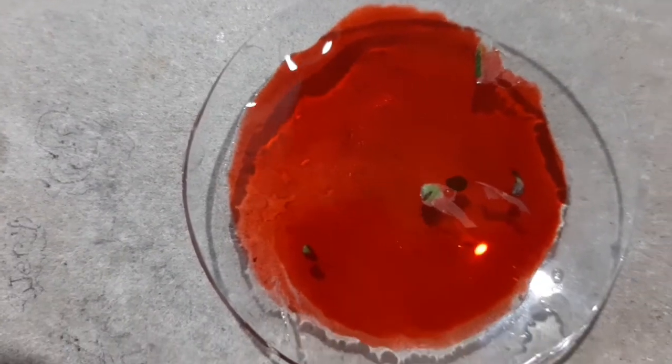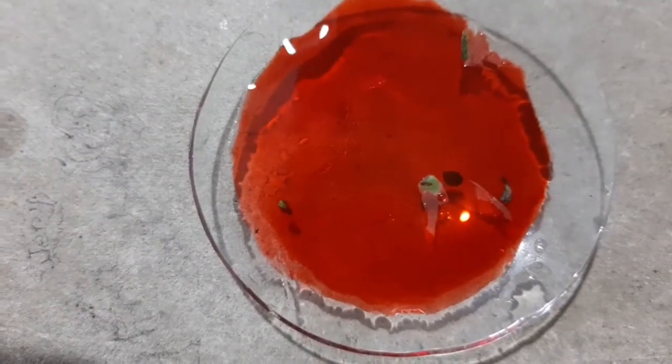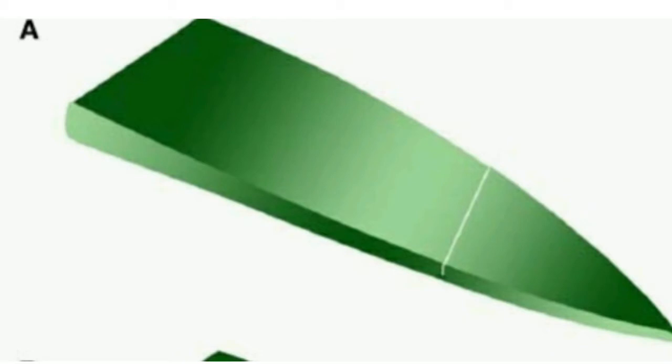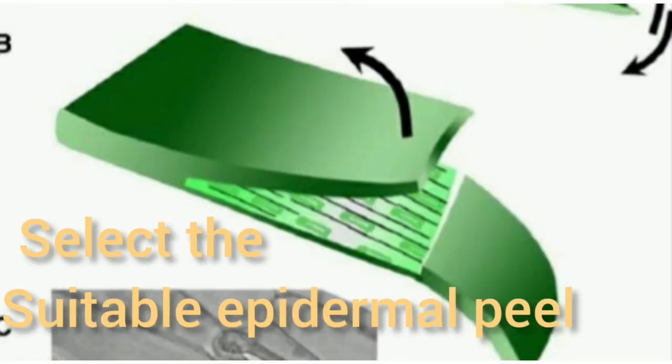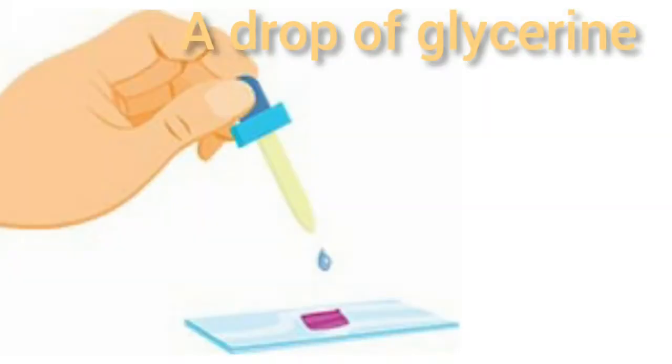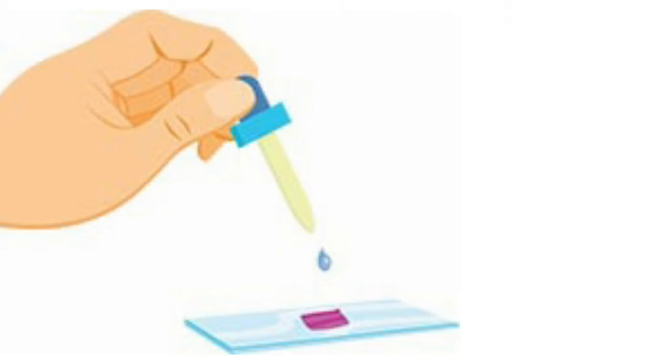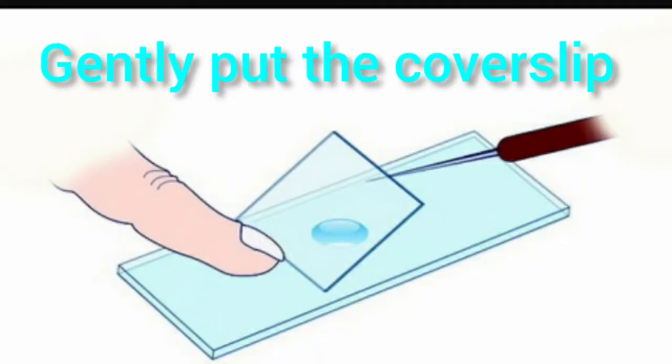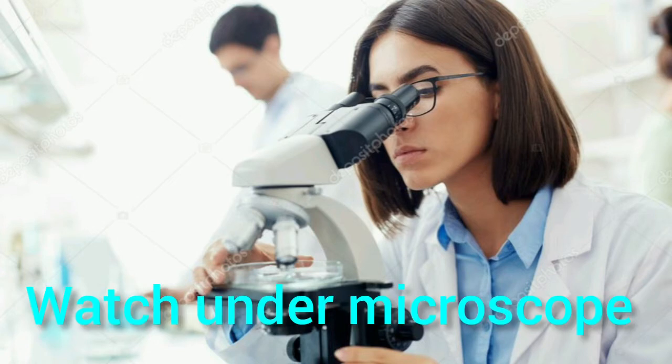And then you select a piece that you think is suitable and then you just place it over the slide. And then you put a drop of glycerine and you gently put the cover slip over it, and then you just watch under the microscope.